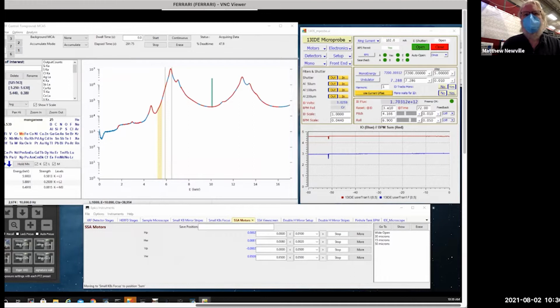So to do that, there are lots of electronic amplification steps in the way, and because the signals are low and we want good measurements of the intensities, those amplifications have to be pretty linear. That is, if you take two milliamps and turn it into a voltage, or take 4 milliamps and turn that into voltage, that ratio better be 2.00, with a lot of zeros in it. So we want that conversion to be linear, but also the way those electronics work is that they have a finite range of output voltage. And so we have to worry about saturating those electronics. It's not the ion chamber itself, and it's not the X-rays, it's just the electronics that we need to be mindful of saturating.